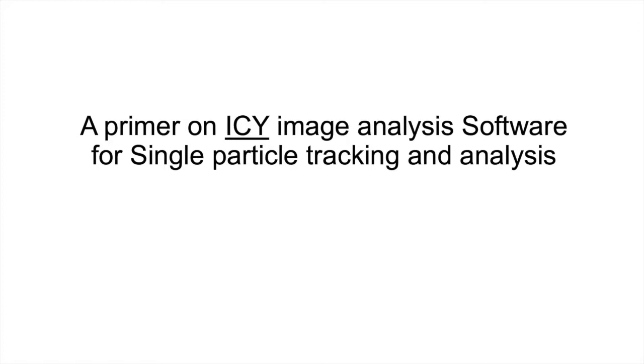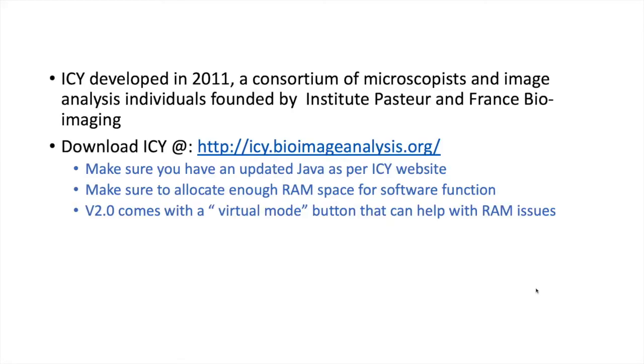Yeah. So we will go through this. The Icy image analysis software was developed by a consortium of microscopists and image analysis individuals, founded at the Institut Pasteur and France BioImaging, and they are based out of Paris. You might have downloaded the software from this website.